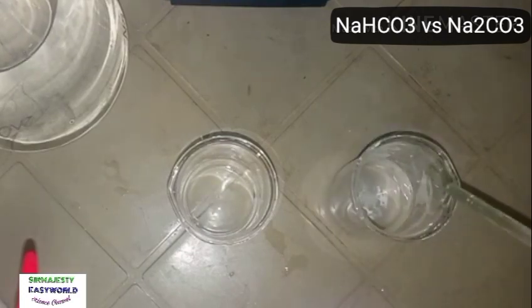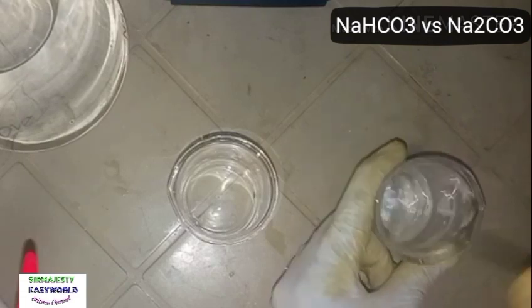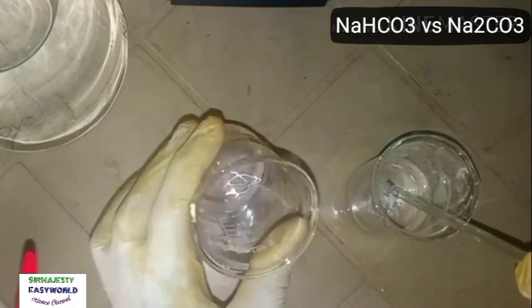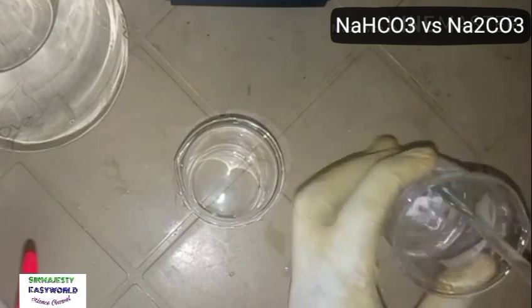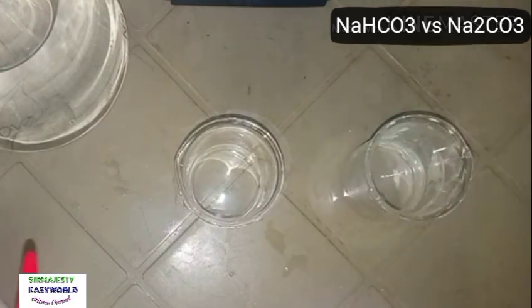Okay, that's it. Remember, if I use the same glass rod on the two, it is a problem. You see, this one has almost dissolved completely. So the carbonate is completely dissolved. The bicarbonate is still yet to dissolve. Like I told you, the bicarbonates don't dissolve as well as the carbonate, of course.